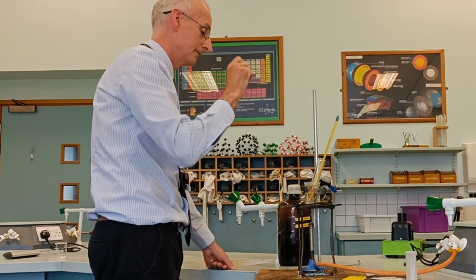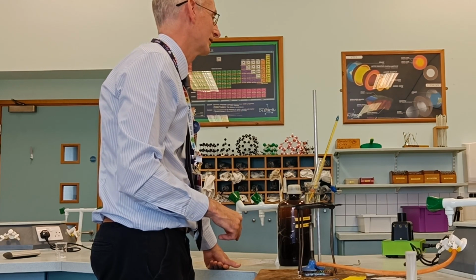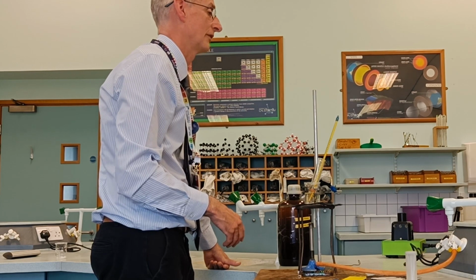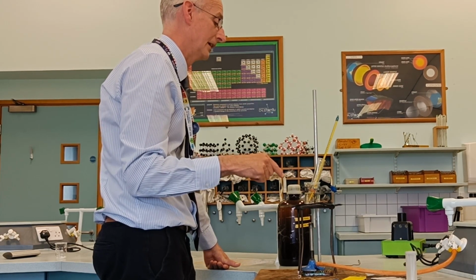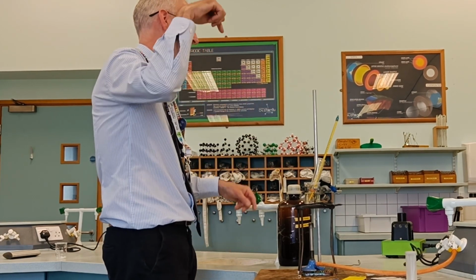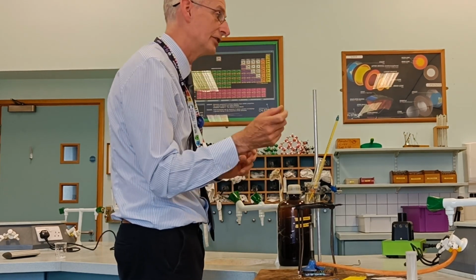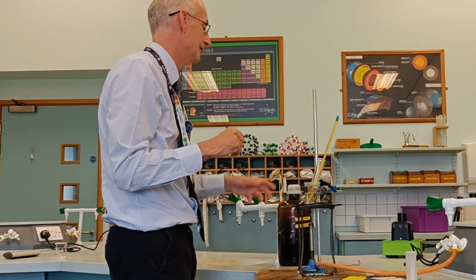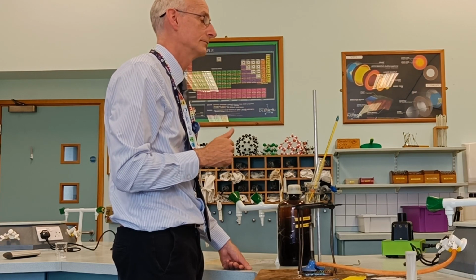So, nice, easy, low-tech method. These things, ridiculously expensive, okay? A couple of £100 each. I'm in the wrong business. But we could be using. So we've got enough to do one of those each. Yeah? So much the same with these ones. The only difference is that you're looking down through a lens, and the capillary tube with your stuff is sitting in a hot metal block, which is being electrically heated, and you can measure the temperature on that. Okay. We good? Happy to do that?